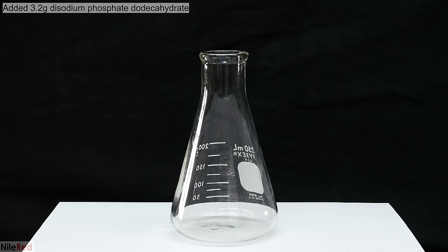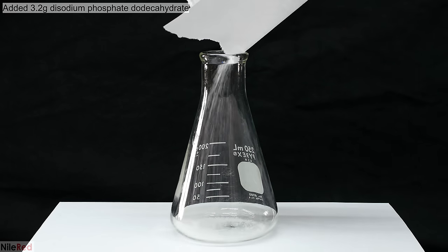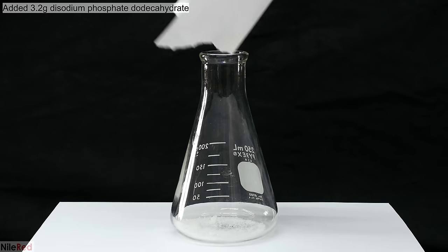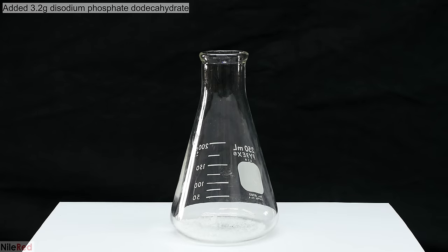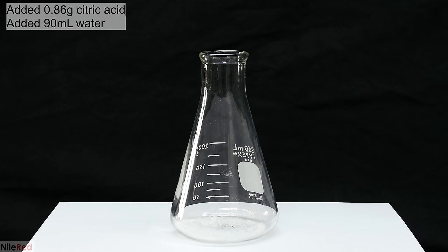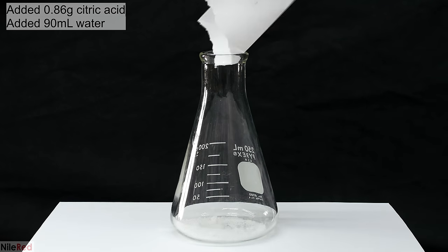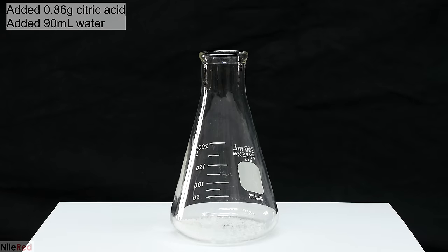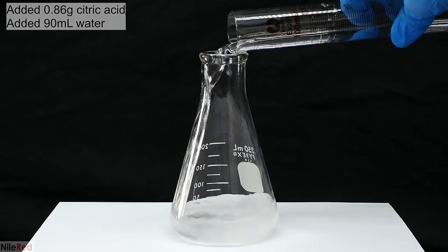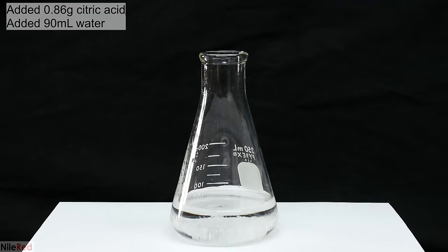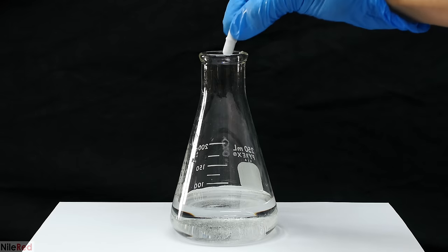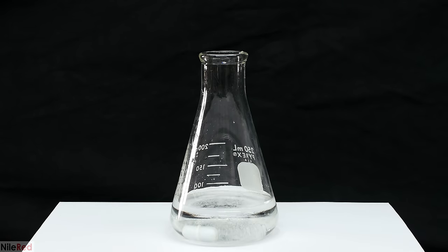The first thing that I need to do is prepare a buffer solution and I start by adding 3.2 grams of disodium phosphate dodecahydrate to a flask. I then add in about 0.6 grams of citric acid and 90 milliliters of distilled water. I drop in a stir bar and I mix things until everything has fully dissolved.